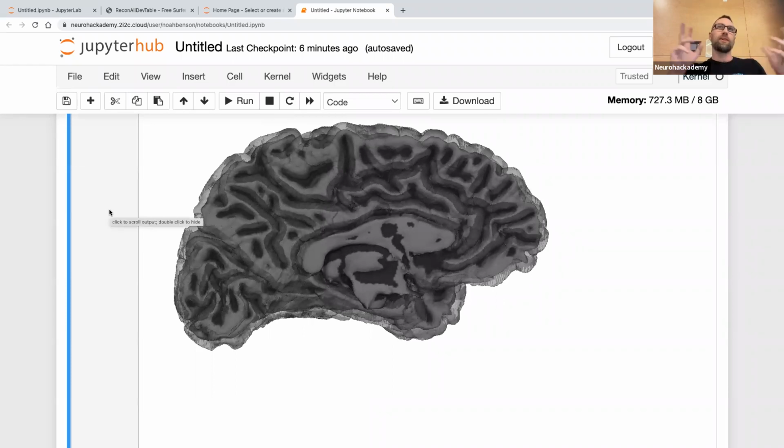So I call this Cortex because it's the closest representation we have. It's the surface in Cortex, but Cortex, of course, is actually a sheet that's a few millimeters thick. So yeah, when FreeSurfer does all this tessellation, it tessellates not just the white matter surface, but also the pial surface. And so you've got both of these, and you can use those to examine different things like thickness and stuff like that.